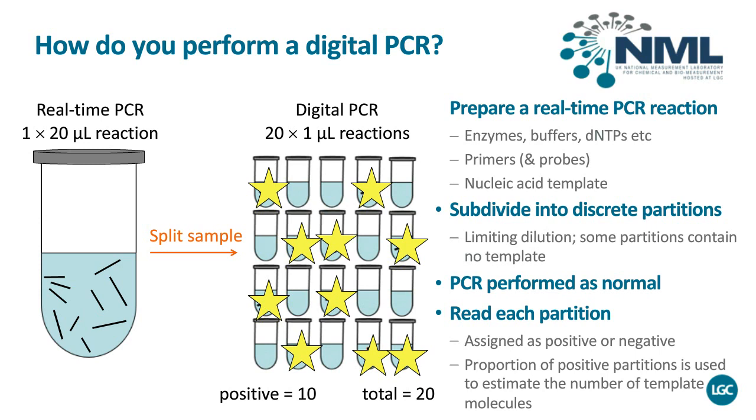Now, in reality, from this particular schematic, in the commercial systems you partition into thousands to tens of thousands of sub-nanoliter partitions.